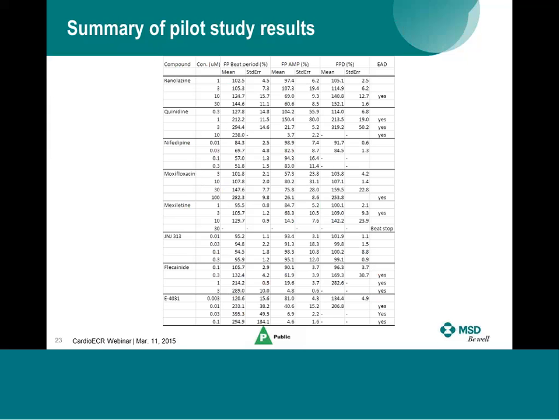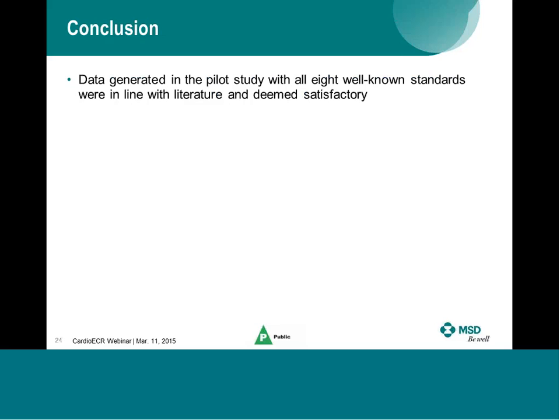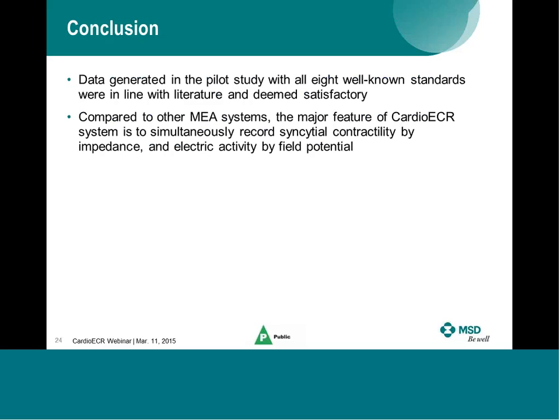So this is the summary of the 8 compounds we studied for this CiPA pilot study. For the interest of time, I won't go through all the data. I just want to mention that in general, the study results were well aligned with literature reports and with our own internal studies with other platforms. So in conclusion, the data generated in the pilot study with all 8 well-known standards was in line with literature and satisfactory.